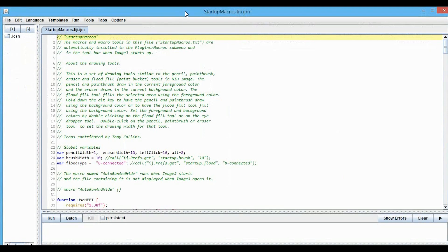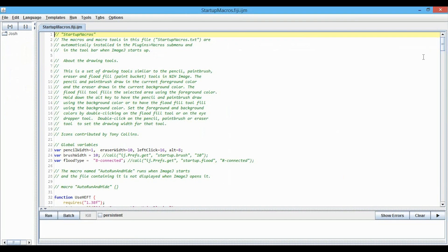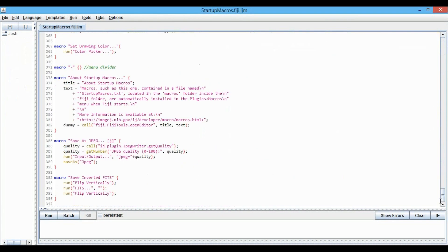You can see that here, and I'm going to scroll all the way to the bottom, so you can see the structure here. These are a little bit shorter, and you can see it's macro, and then the name of the macro, and then the code in between these braces.